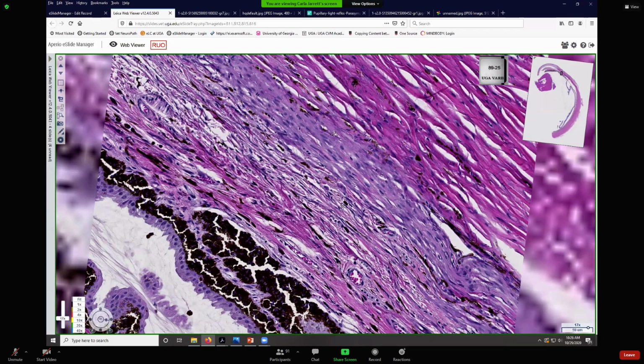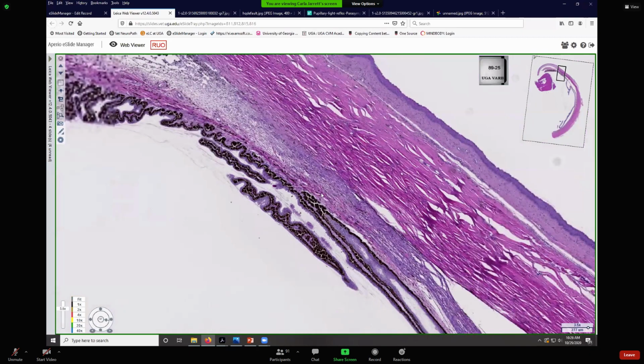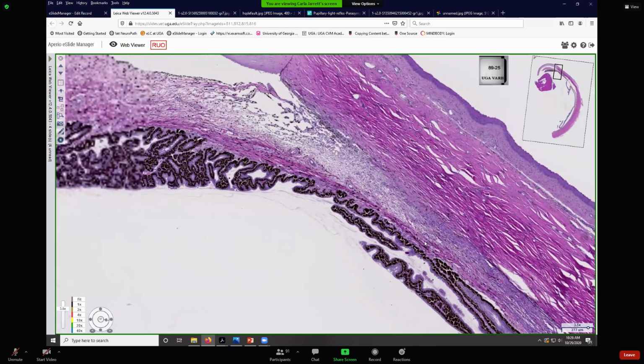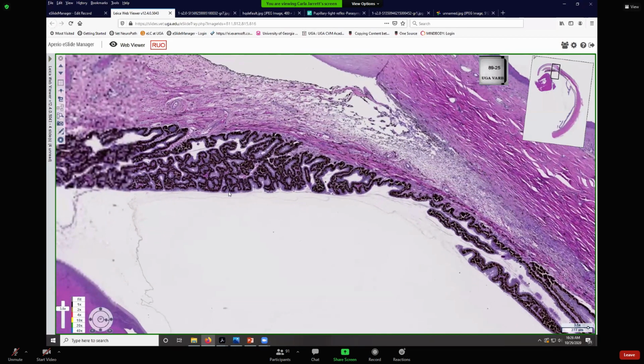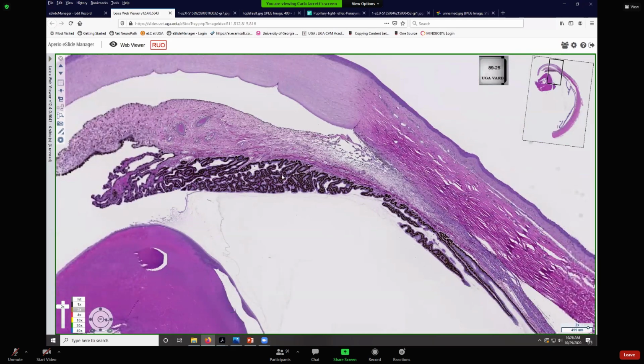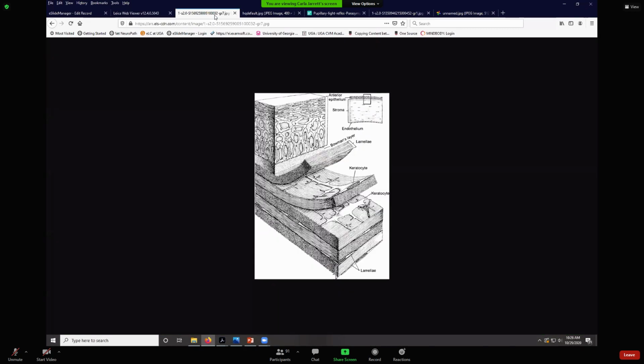All right, so this is ciliary muscle. This is the ciliary body. The ciliary body has the flat part, or the pars plana, and then the folded part, the pars plica. Plica means folded. Now the folded part is called the ciliary processes, and they are just an extension off of that ciliary body. What is this for? What's the deal with the ciliary body and the ciliary processes?